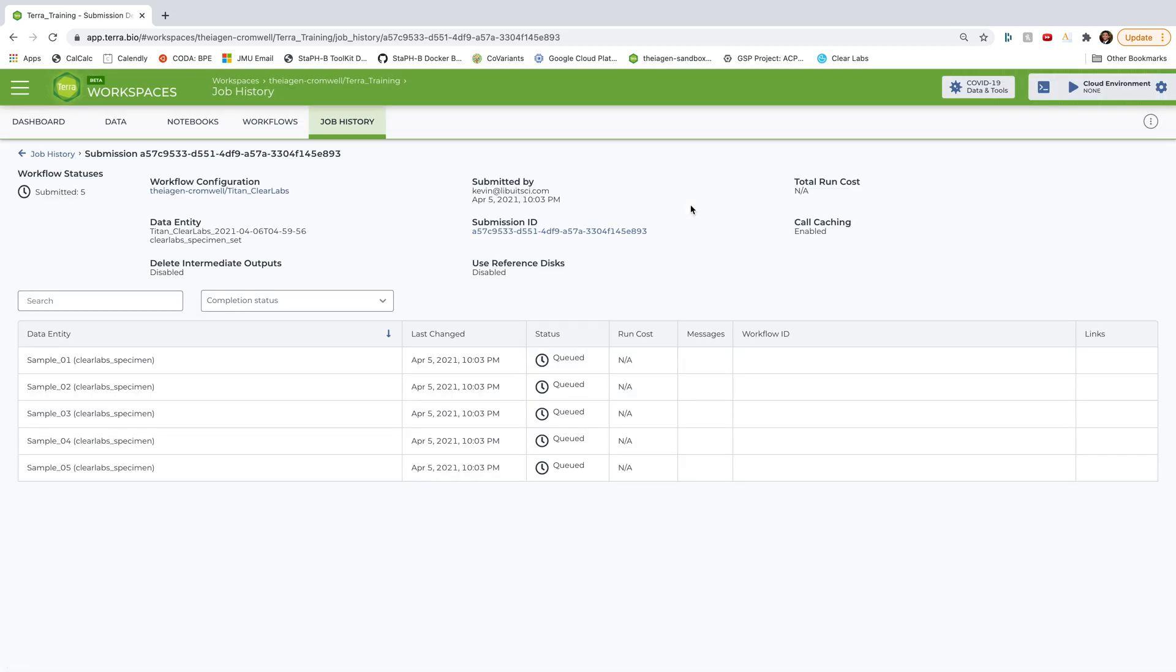All right. And boom, the analysis is initiated and we are generating SARS-CoV-2 consensus assemblies, gathering the QC metrics associated with both the read data and the assemblies themselves, and performing lineage and clade typing for these five samples.